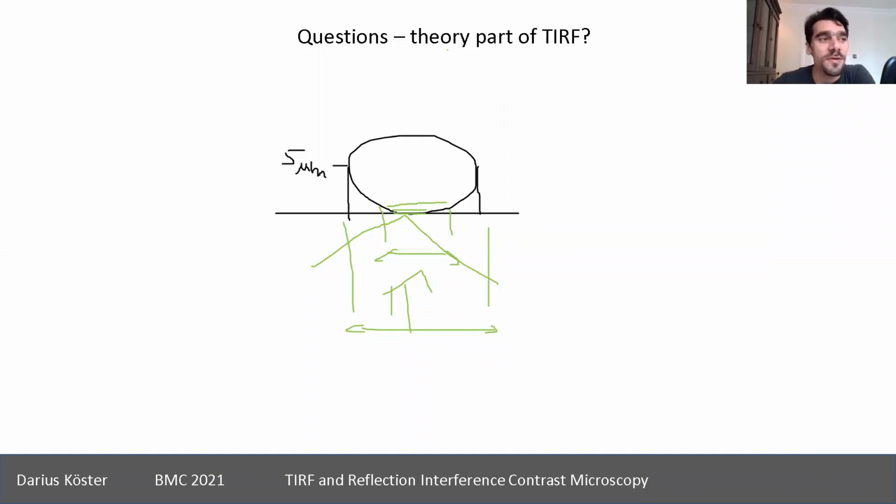And then I think on the newer softwares from some commercial partners, they even directly write you what the estimated penetration depth is. But yeah, if you really don't know what your microscope is like and what the powers are, it's definitely worth giving it a try like that to see whether you are in a TIRF. Okay.